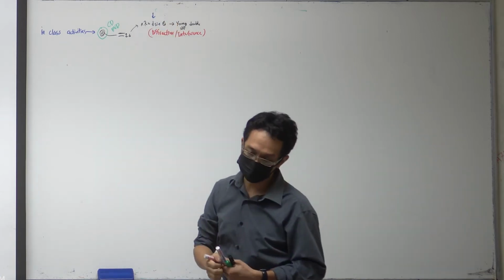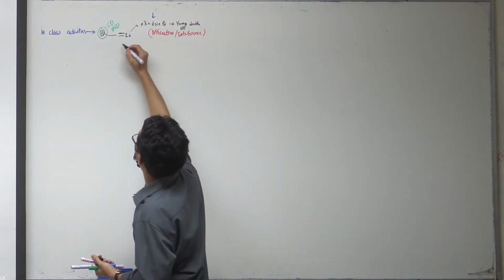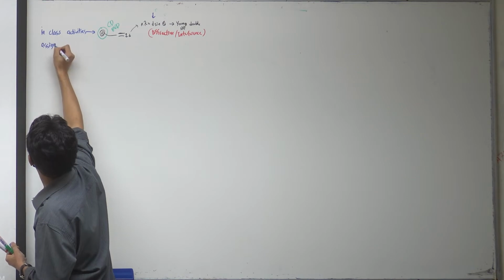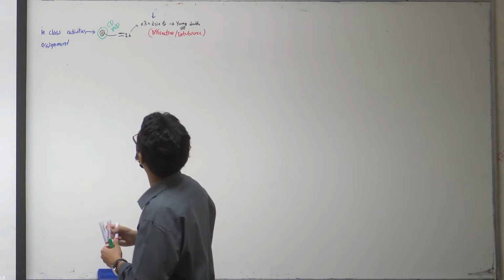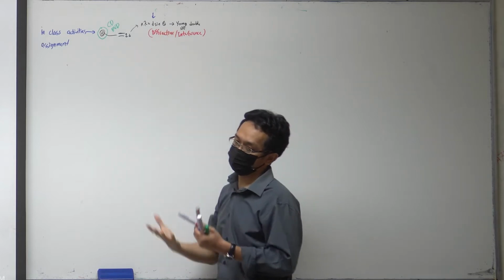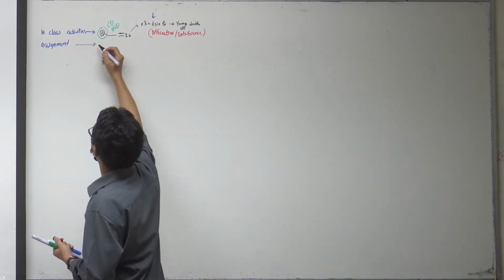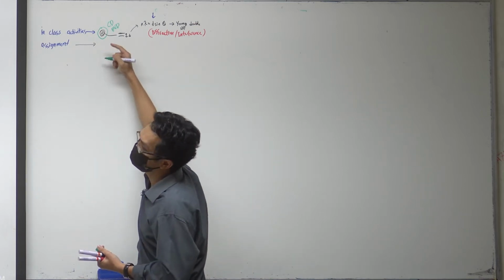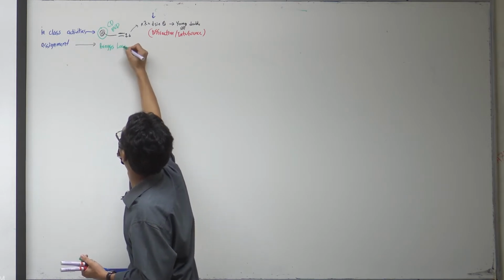And then I asked you to do an assignment on Bragg's law. The only assignment you will have in this course is this. What I asked you is to find how this differs from the equation that people normally use in X-ray diffraction. So in the assignment, I asked you to look at another equation, which is called Bragg's equation. People call it Bragg's law or Bragg's equation.